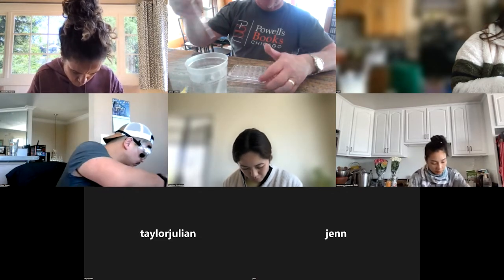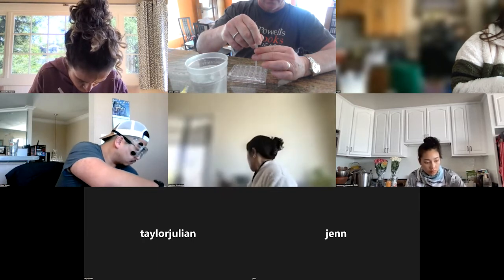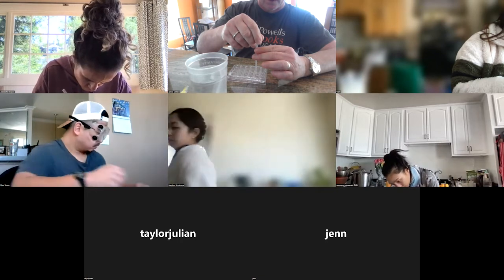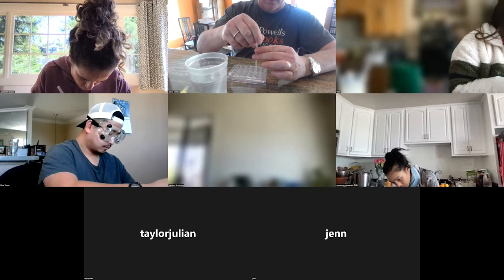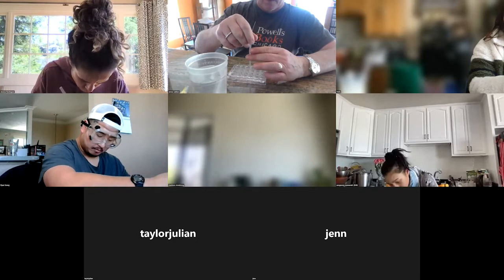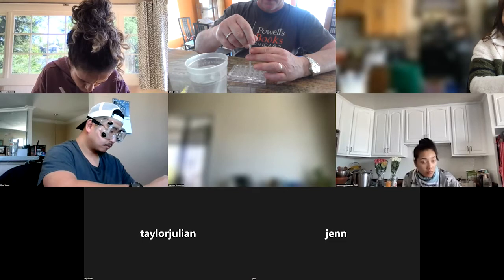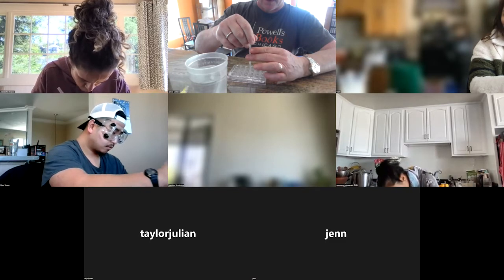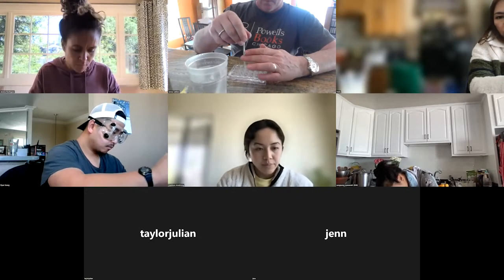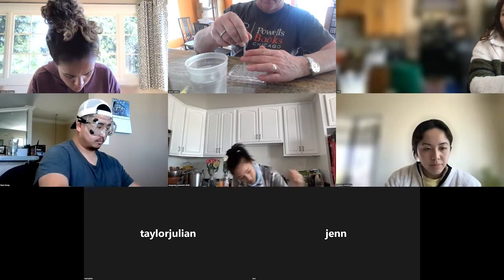And the next one is 15 drops. And then the next one I do 10. And then 5, and then none.